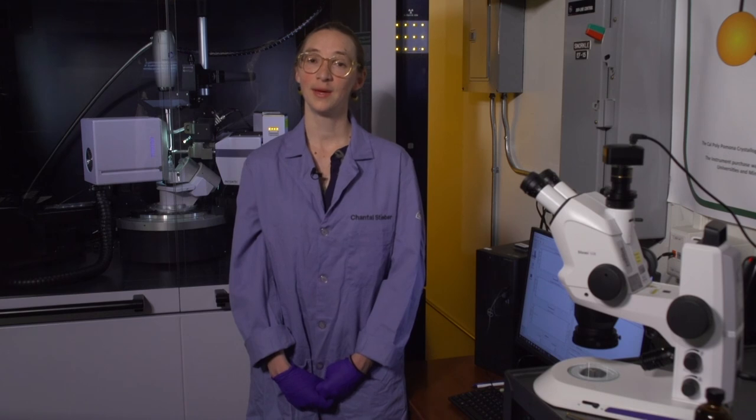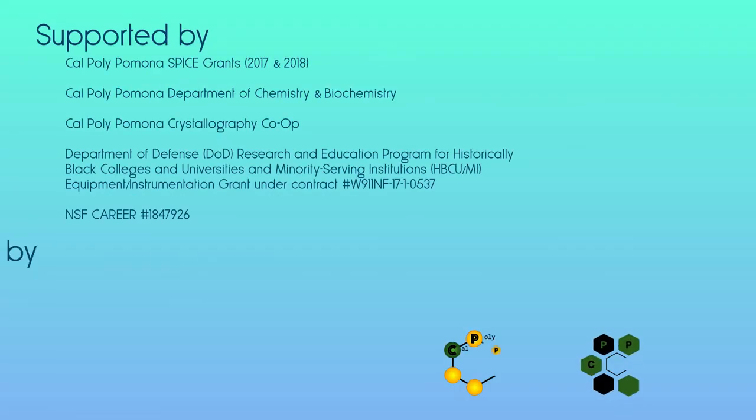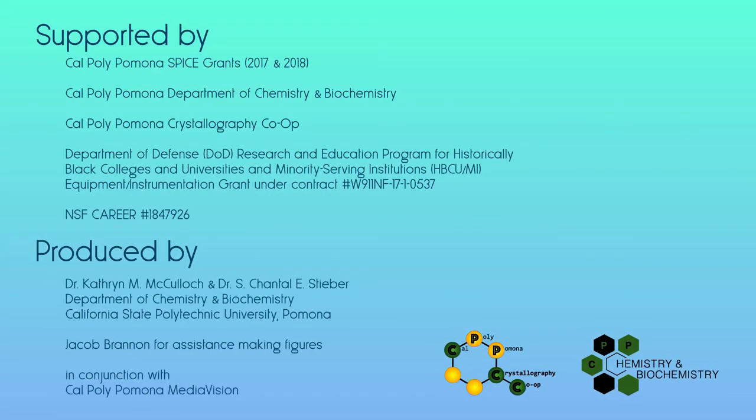We hope that this series helps you understand the data collection process.